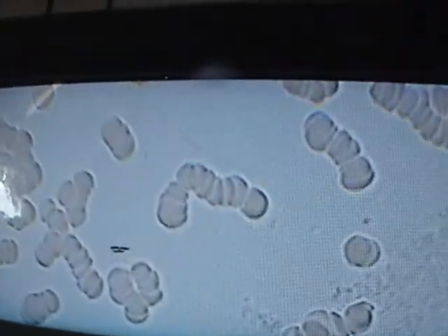Is he a young horse? How old is he? Four and a half, four and a half. Here you go, Tom. Got a nice big crystal in the middle there. And this one right there. There's some fungal buildup right here — it's the first I've seen.